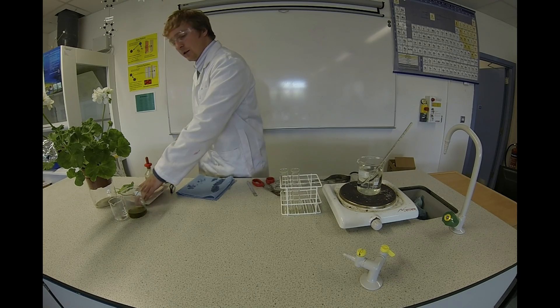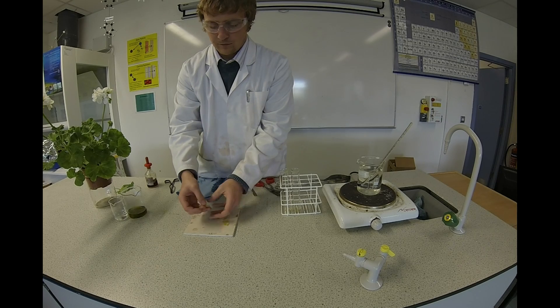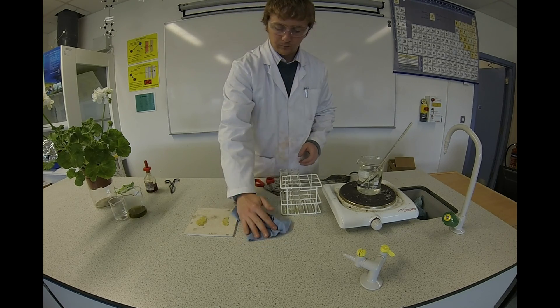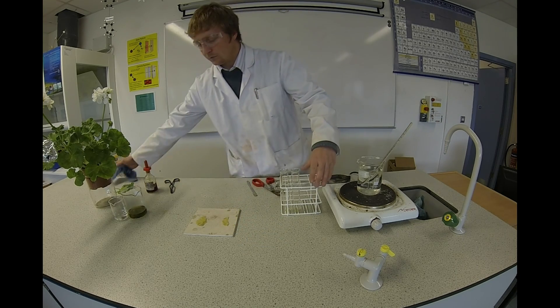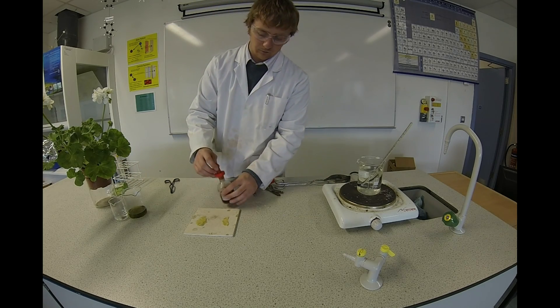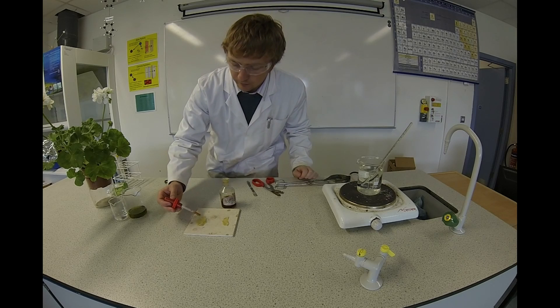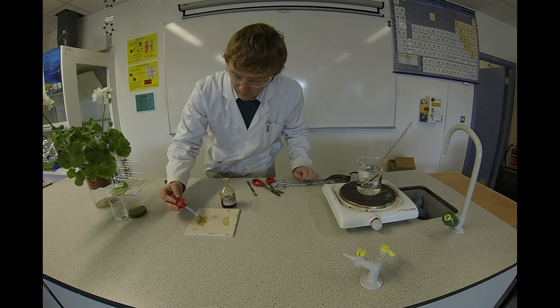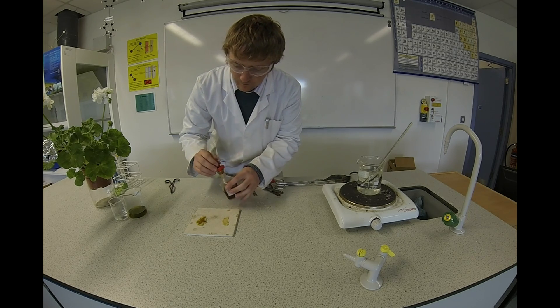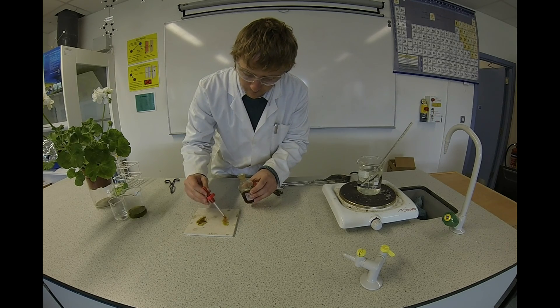Iodine, as we know, shows the presence of starch. A few drops on each should do the job.